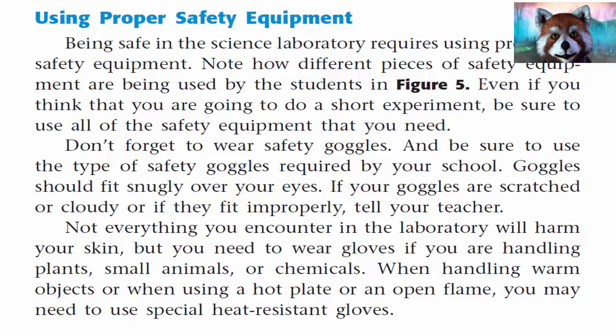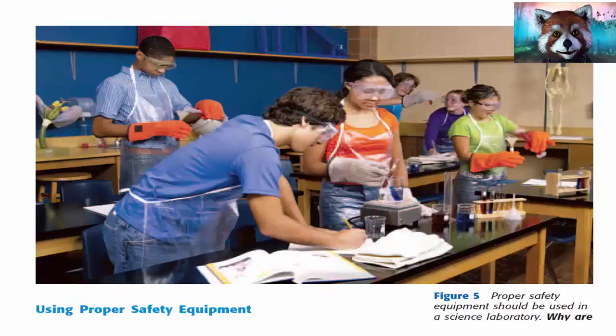Using proper safety equipment. Being safe in the science laboratory requires using protective safety equipment. Note how different pieces of safety equipment are being used by the students in Figure 5.